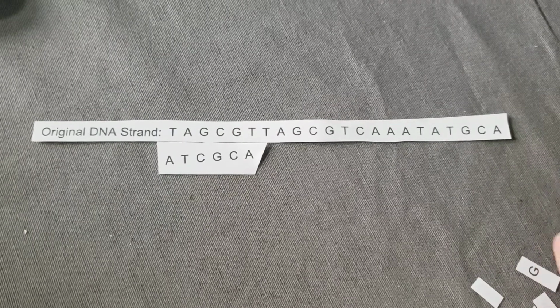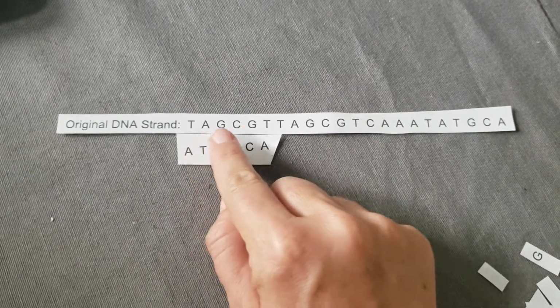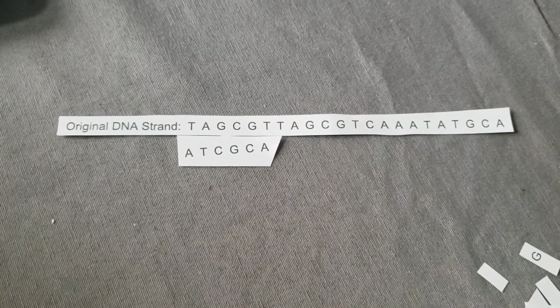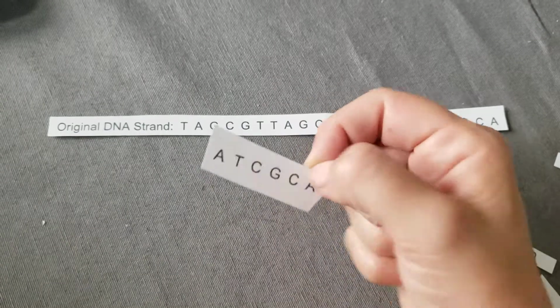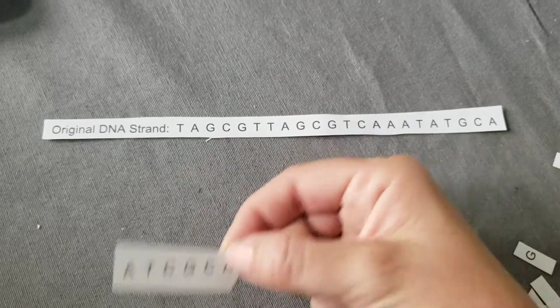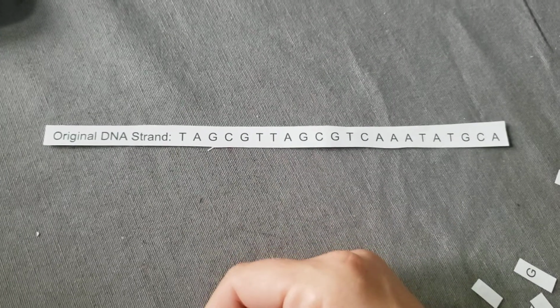And why did we get no results? Because perhaps what ends up happening is this DNA did not actually belong to the flu. So what might have happened is your primers that you suspected would work with your flu virus won't have anything to attach to if in fact what's in the tube is not flu virus.